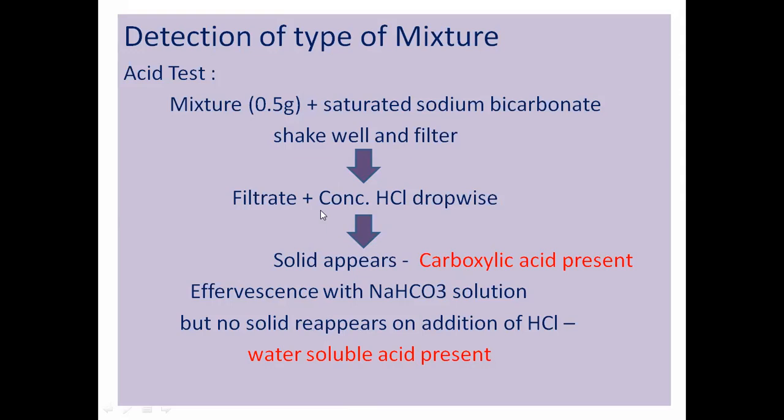So this is how you do the acid test. You must know why you are adding this saturated sodium bicarbonate, how it works. So this is for the acid test. Are you understanding what I am saying?